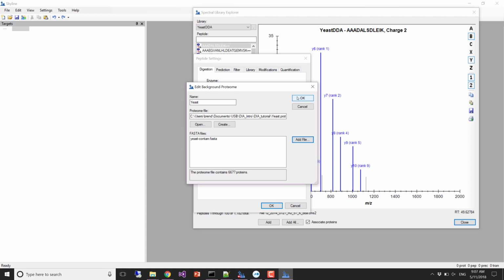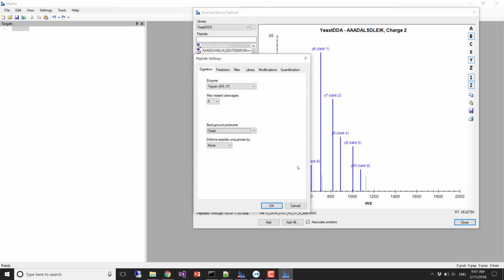All right, so well, we're 5 minutes over, we're 8 minutes over. Who would like to move on to the main session for this? We did not actually get our targets, and we don't actually have another day to continue this. But we should probably get on to the main event of analyzing larger data sets. But this is how you would build this.